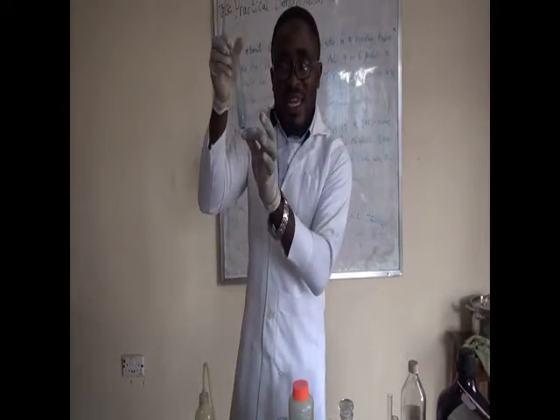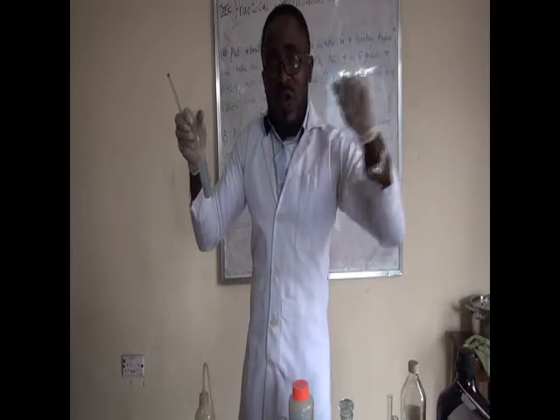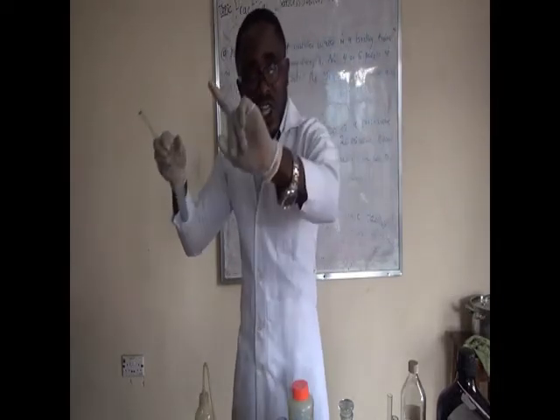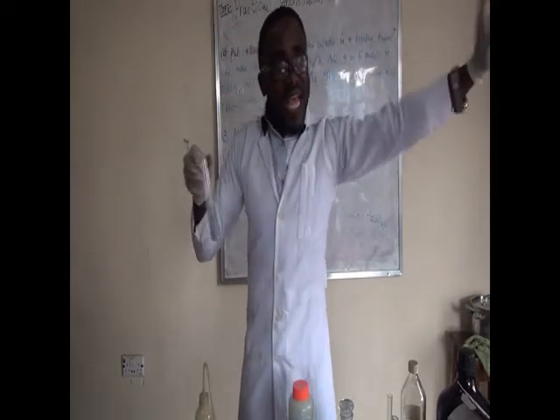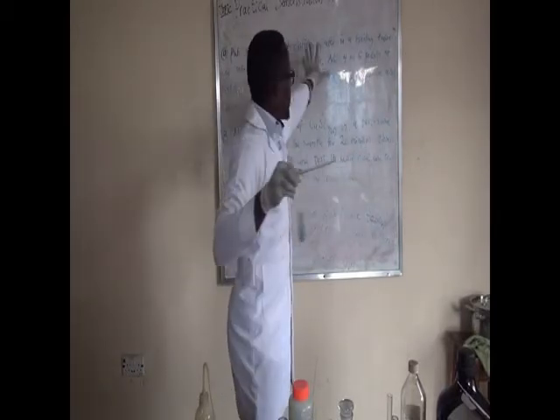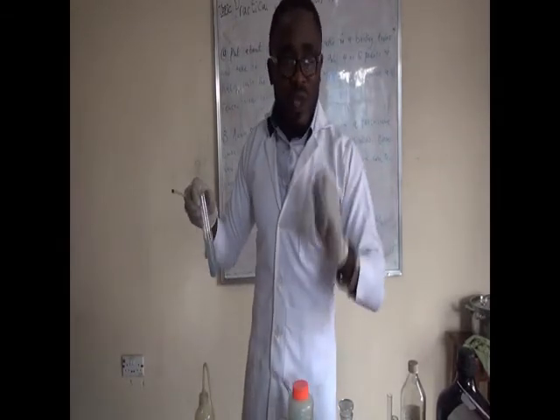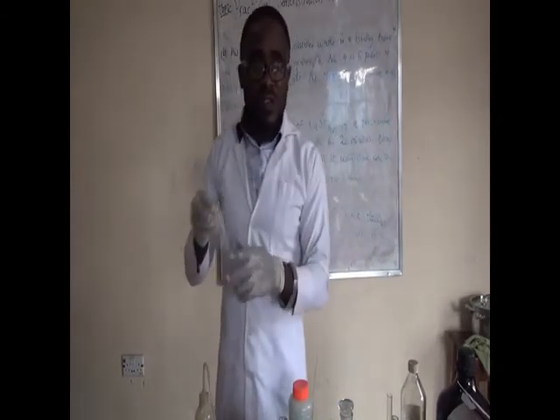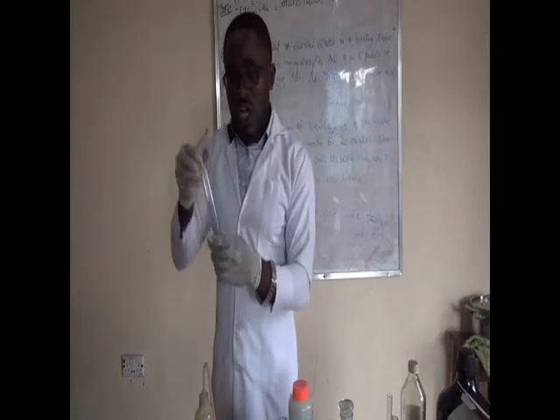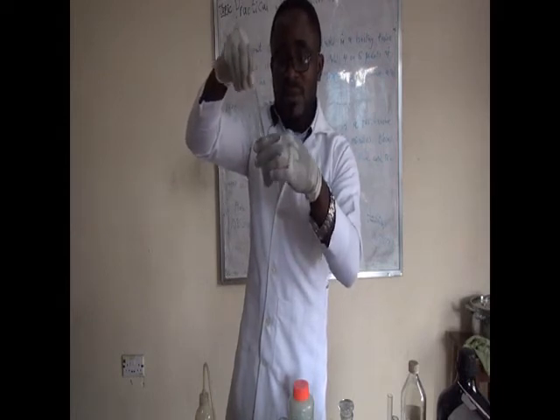Chemistry practical is reported in 3 formats: the test, the observation, and the inference. For the test, you write 5 cm cube of water added with about 10 pellets of sodium hydroxide. In your observation, you find out that the sodium hydroxide pellets dissolve in water when stirred. It will dissolve in water for some time.